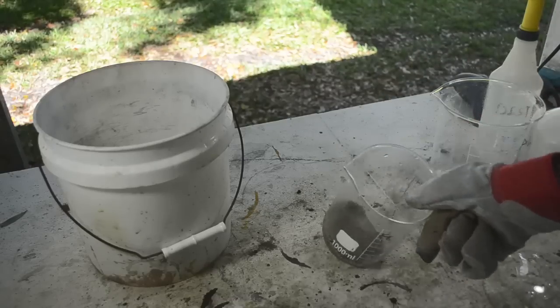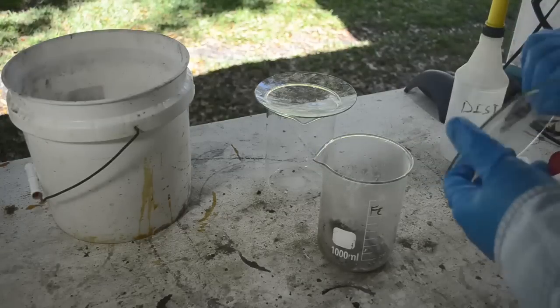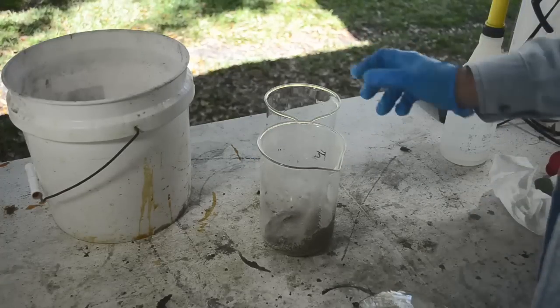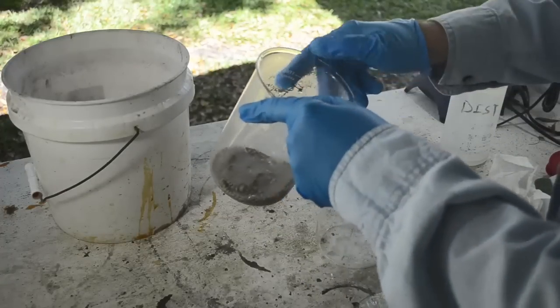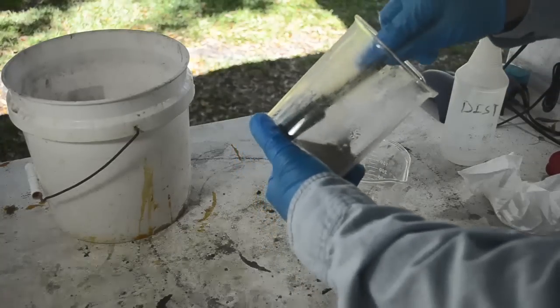So I'm just going to divide this up between two different beakers and we'll try cleaning it up with some acid. Okay, here's our as clean as I can get it cement silver. And what I'm going to do is put roughly half of it in this other beaker. I'm not too worried about dividing it perfectly in half.